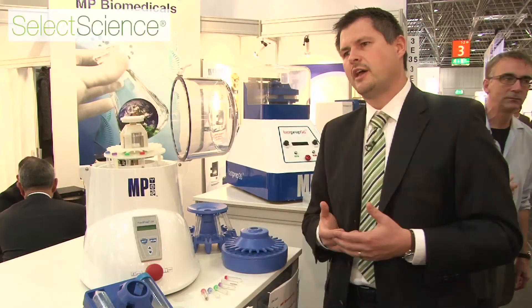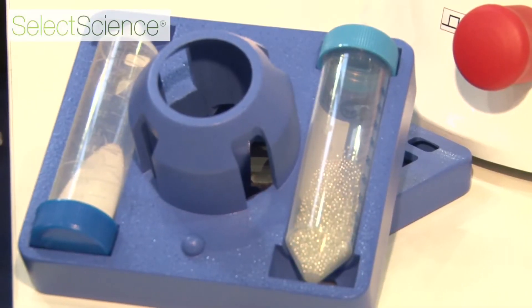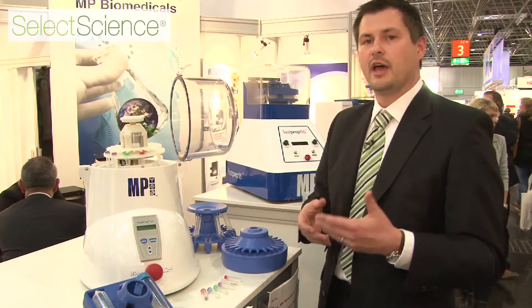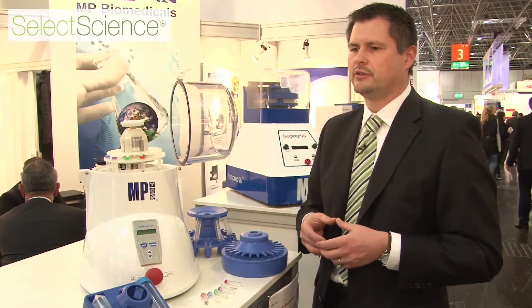For that purpose we have very different materials in the tubes — we call them matrices — and we can homogenize from bacteria, over yeast, to fungi, to leaves, to different tissues from skin and bones that are really hard to homogenize, and we have the right tailored material for those. We also have a lot of different kits you can use together with the machine, and this will help you to extract DNA and RNA, and also proteins can be extracted.